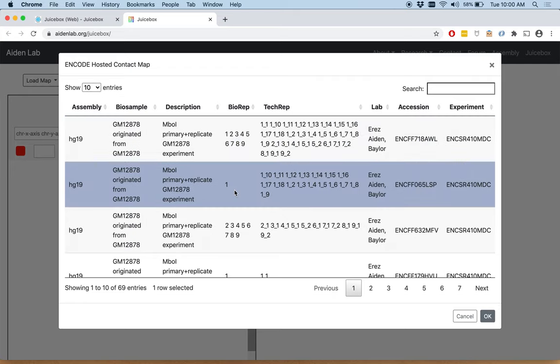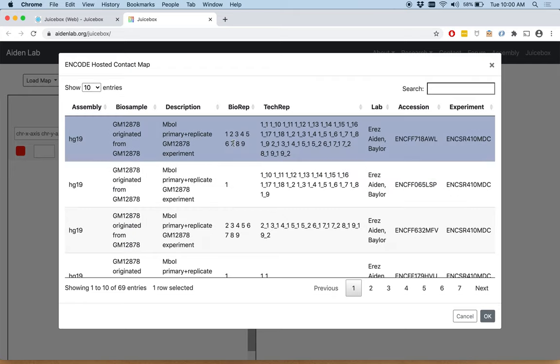Otherwise, you can click multiple and load at the same time. But for now, we're just going to load one file and click OK.